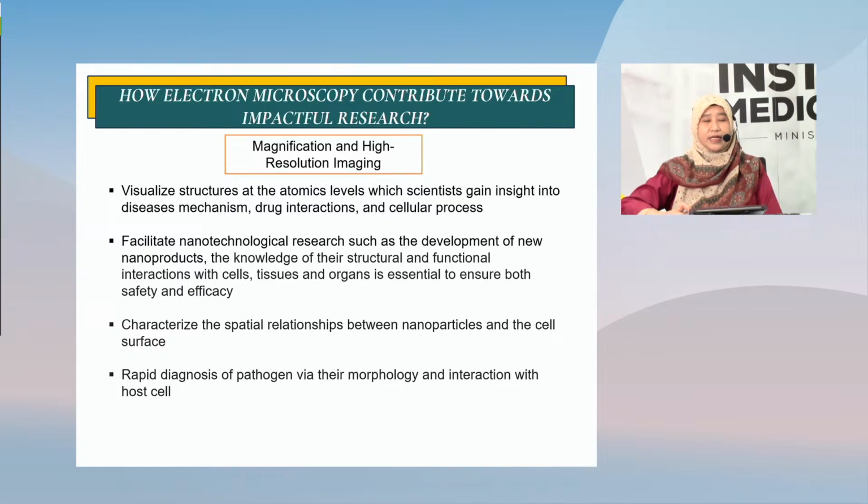With this technology, it can provide exceptionally detailed images, which can help researchers, for example, to visualize structures at the atomic level.